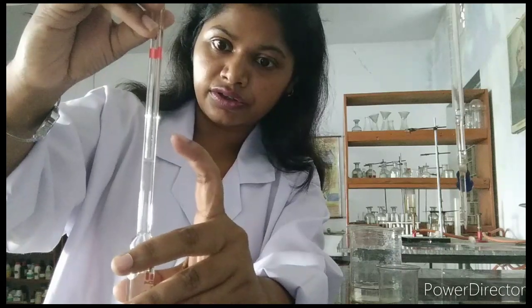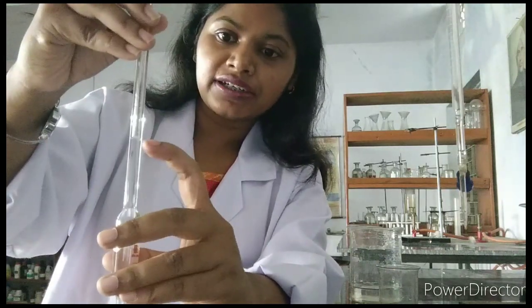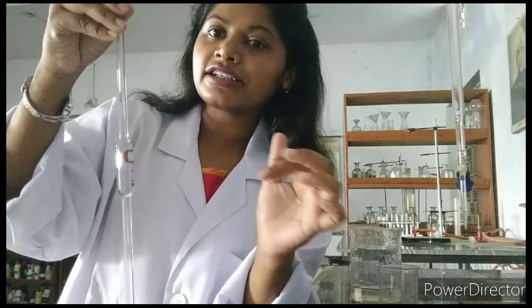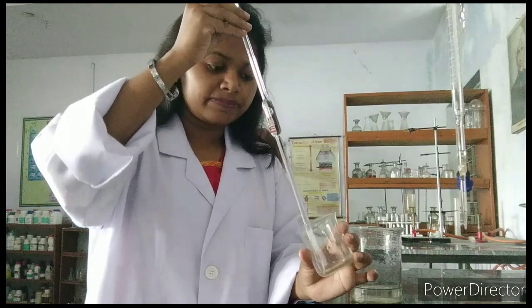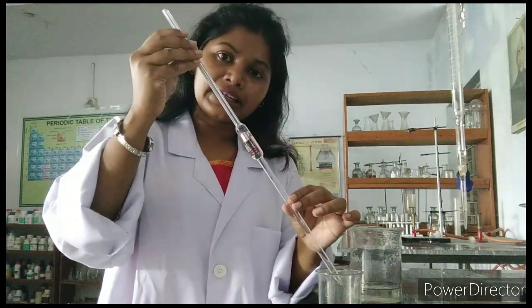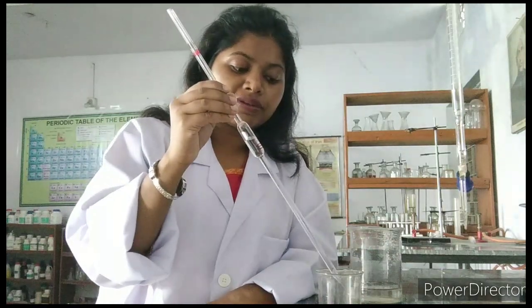Slowly stop. Done. Now at this point where it reached the edge mark, this is the 10 milliliter — the required solution that we want for our practical. I will collect it here in the small beaker. If you tilt your pipette like this, it will easily go out. This way we can do it.